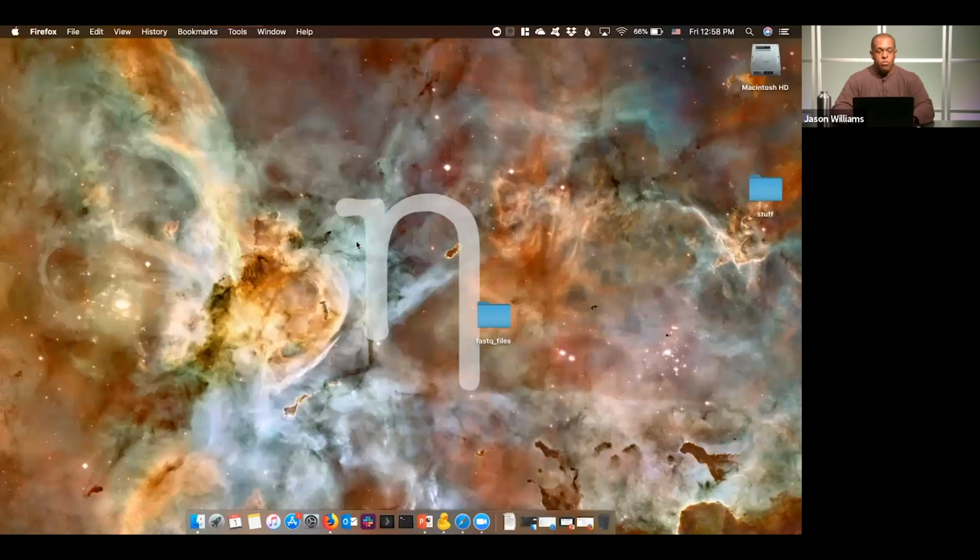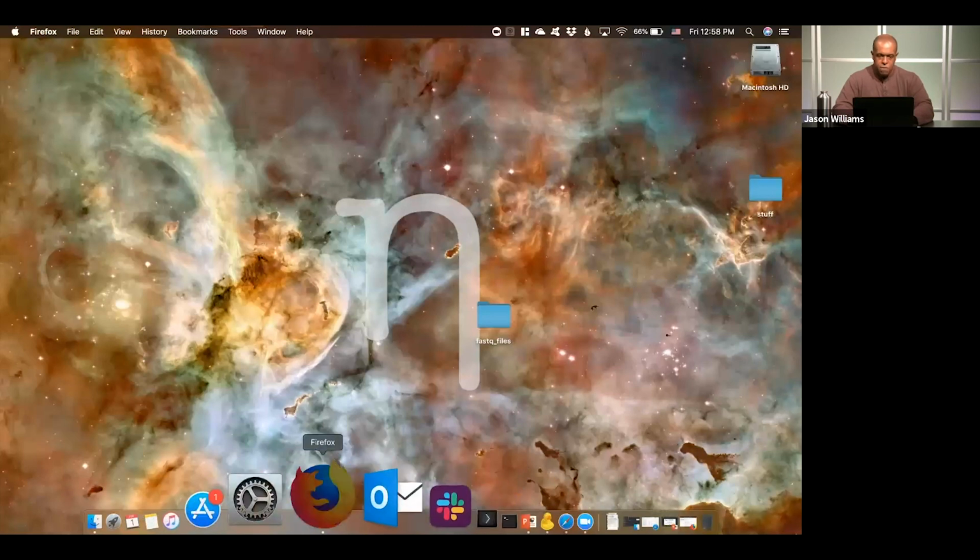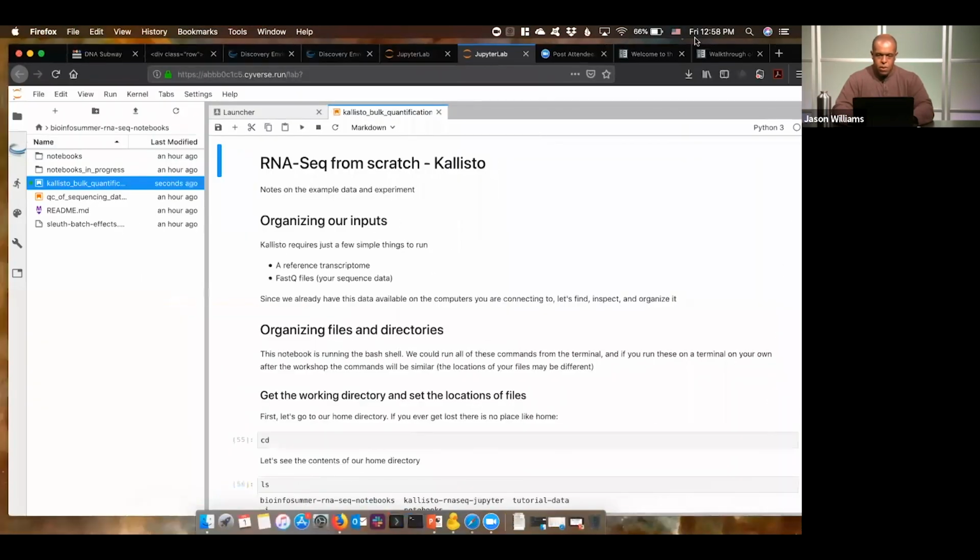So that's the next question. Where can I find a data set to upload? We provide some sample data sets, as you saw with the human example. The other place to go for sample data, if you need some for teaching, is the RNA-Seq for the Next Generation website; there are some data sets there. And also there's a tutorial on learning.CyVerse.org about importing data from the Sequence Read Archive. I might be able to bring that up quickly.